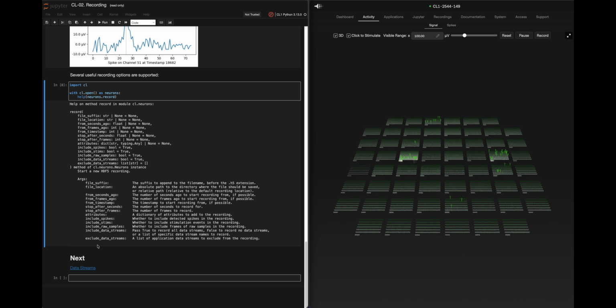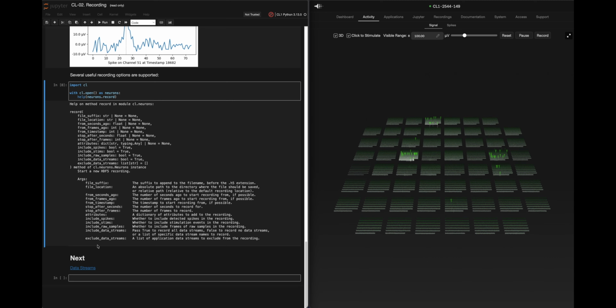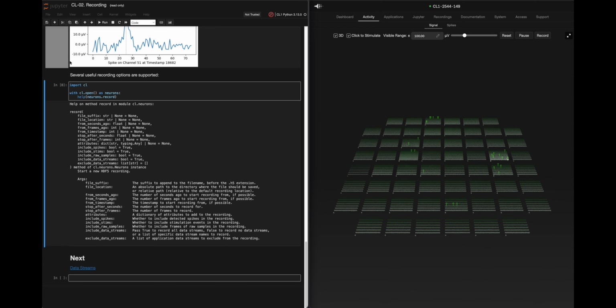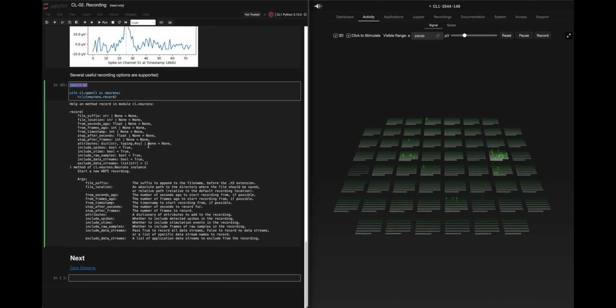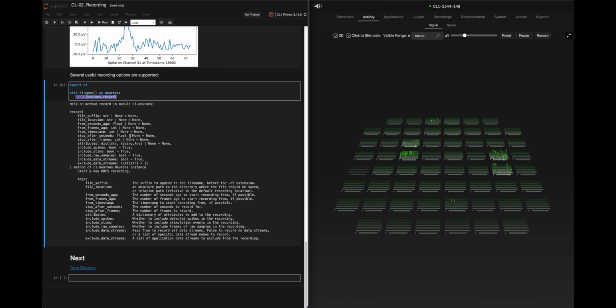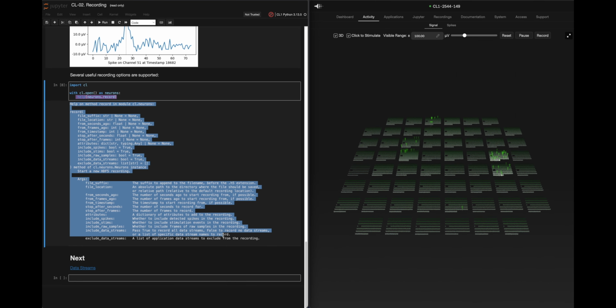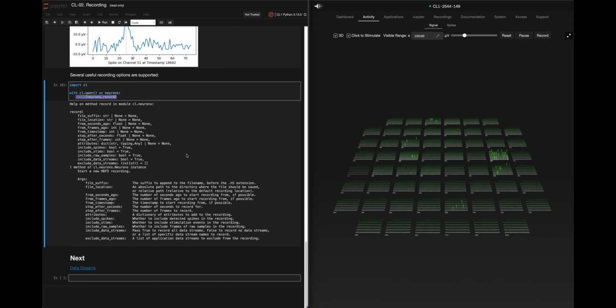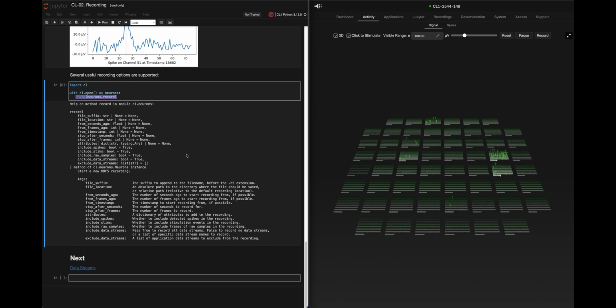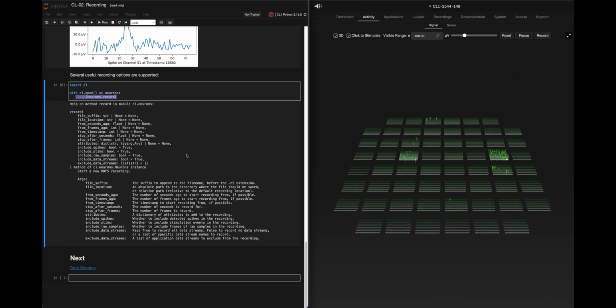And again, this is another more exploratory video where I want to spend some more time digging into, hey, we have this import CL package here. It's essentially like you've got a bunch of different Legos, and when you run the help method on neurons record right here, you get all those, and you can find them in the documentation on GitHub. But it's very important to start thinking creatively, before you just jump in with an agent, about how you can use these different recording methods to bolster and strengthen your research approach.